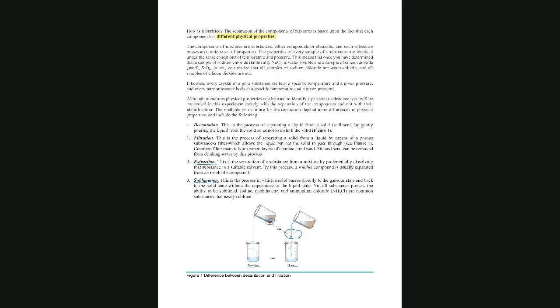Not all substances have this physical property, but our substance, ammonium chloride, sublimes, which means that when we heat the sample, the solid passes directly from solid to gas without showing a liquid state. There are other substances that also sublime, like iodine and naphthalene.